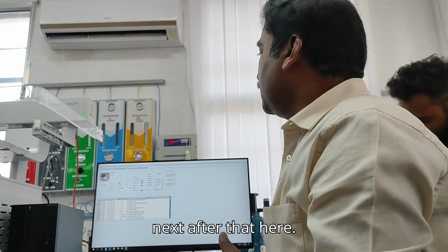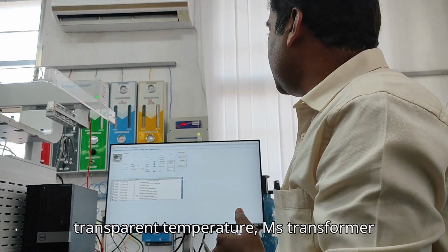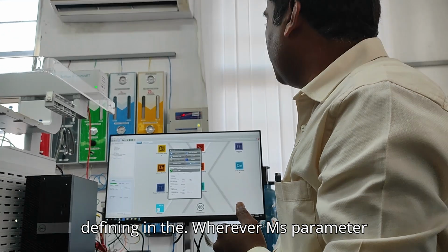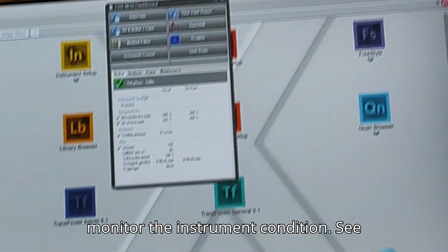Next after that, here is the temperature as well as your MS transfer line temperature. The MS transfer line temperature is defined wherever the MS parameters can be defined. Here in this case, we have the TSQ dashboard series. Here you have to monitor the instrument condition.